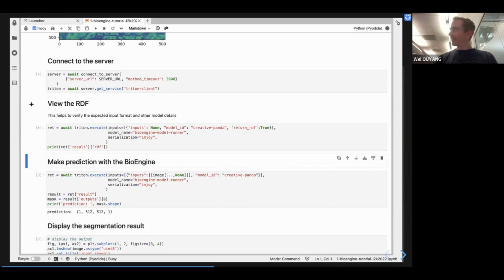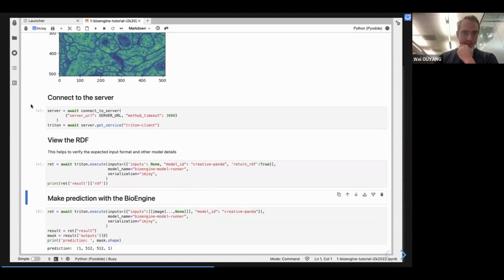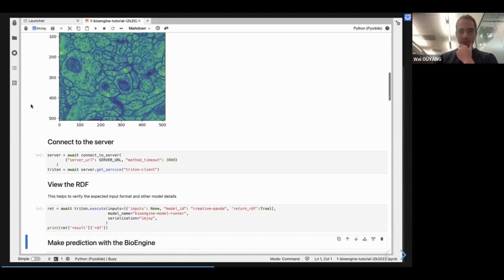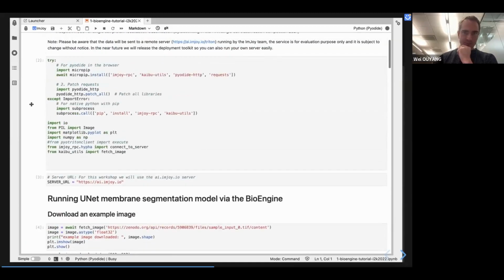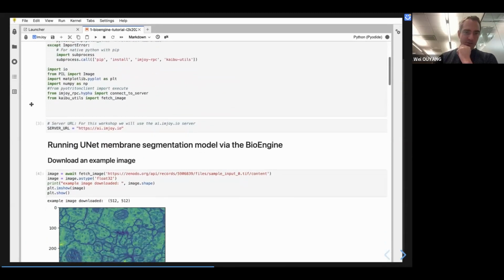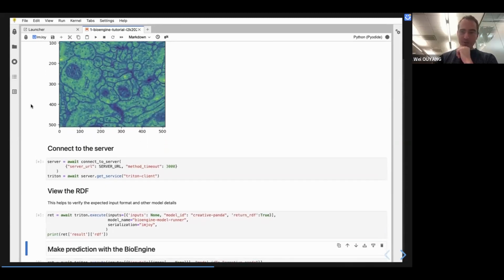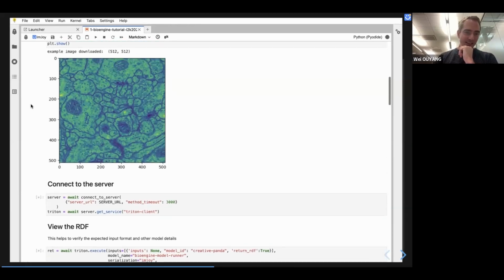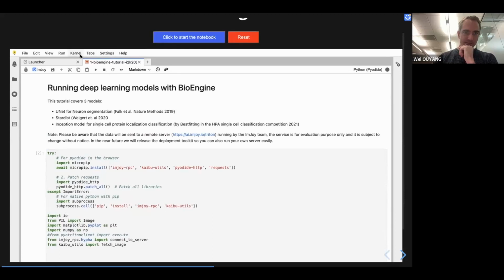In case you have a problem, you just reload. Restart the kernel. You will need to restart the kernel. Yeah, it's got a timeout of 3000, is it? Yes. Okay. So sorry for anyone who's experiencing issues with that running at the moment. That's basically just because we're all trying to run it at the same time. I can restart the kernel. But yeah, we'll just restart the kernel.